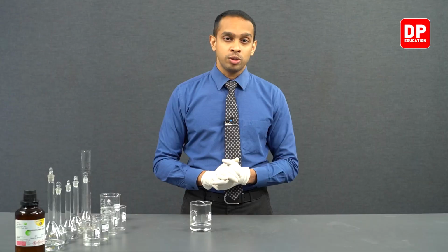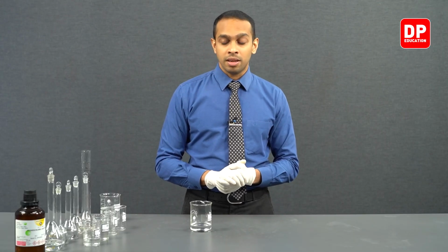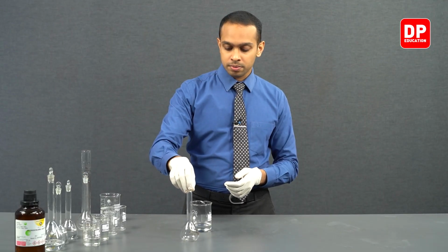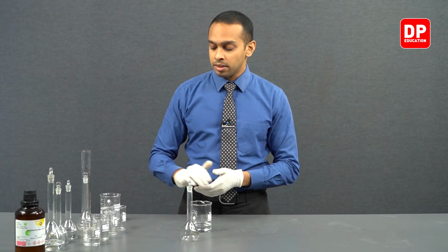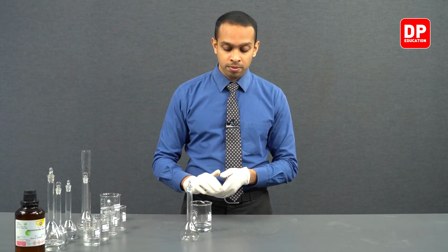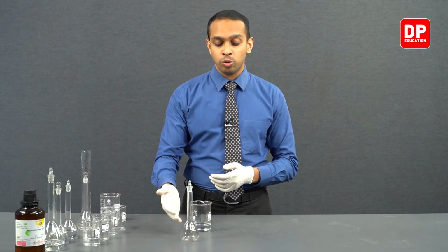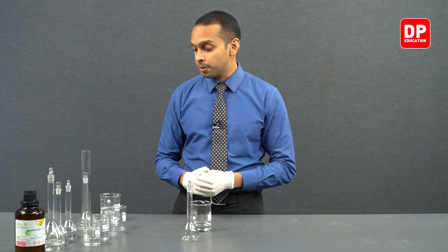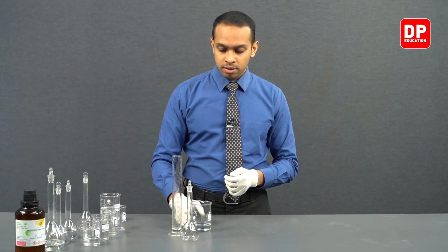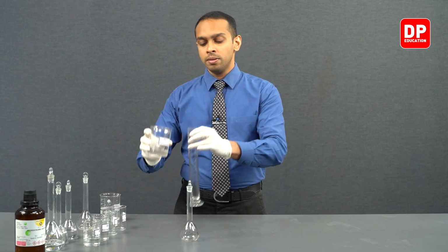Now, in order to produce 0.4 moles per decimeter cubed concentrated HCl, we are going to be taking another volumetric flask, and we are going to transfer 40 cubic centimeters of HCl into this volumetric flask and then fill it all the way up to the calibrated mark. We can take a measuring cylinder here and we have 1 mole per decimeter cubed concentrated HCl.